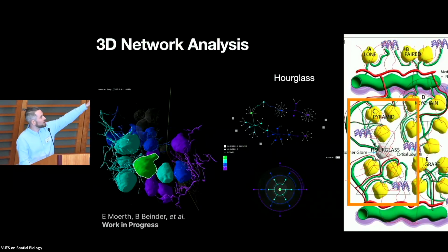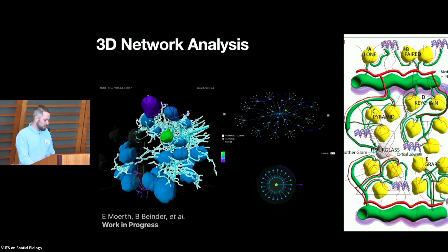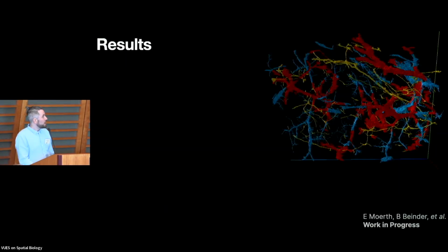And now in this abstracted view, you can very nicely see there's a group of glomeruli. Then I have this central hub, which is now in green, that then connects to the other group. And all of this is interactive, so you can zoom and pan, go in and really have a deep look into your data. And then also the grape that we've seen so far for the kidney, another data set that Ashley Keeman shared with us some time ago.